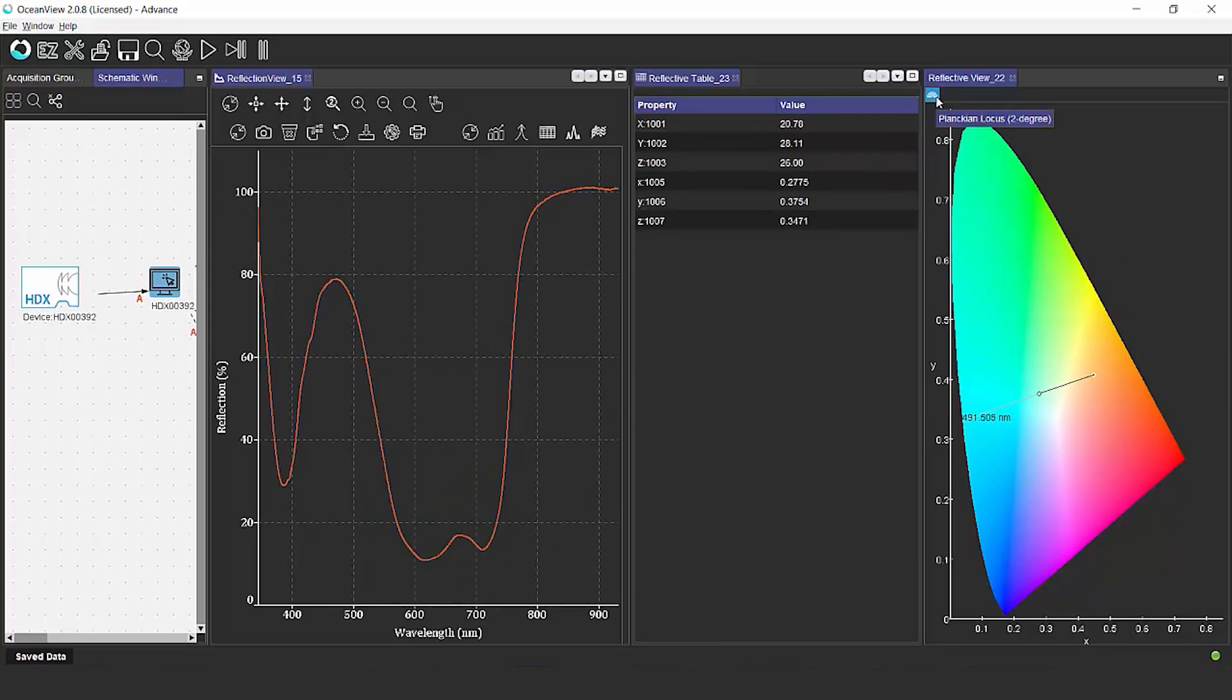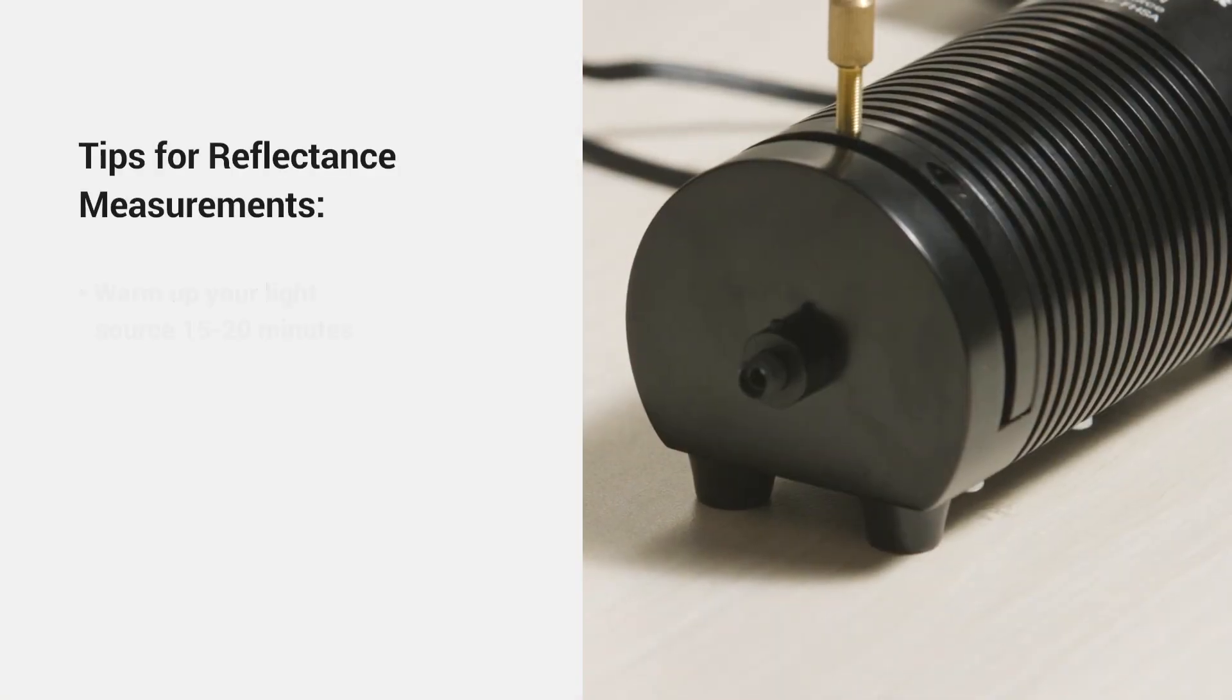Whether you're looking at color consistency, matching paint colors, we're actually getting quantitative values that will enable us to ensure great consistency. So what we've gone over today are the critical steps required to set up your diffuse reflection measurement.